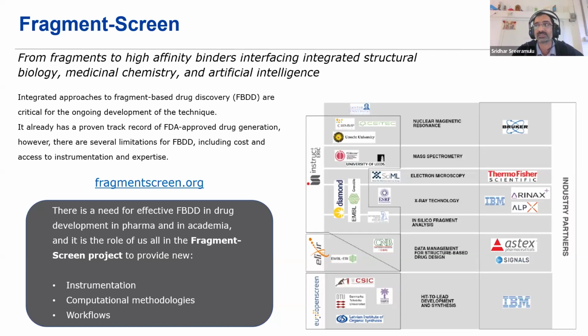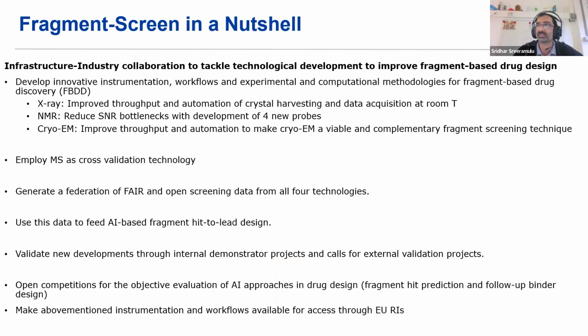To address certain challenges, Fragment-Screen is coming together to bring instrumentation, computational methodologies, and workflows into one framework. We try to involve several technologies like X-ray, NMR, cryo-EM, and mass spectrometry.